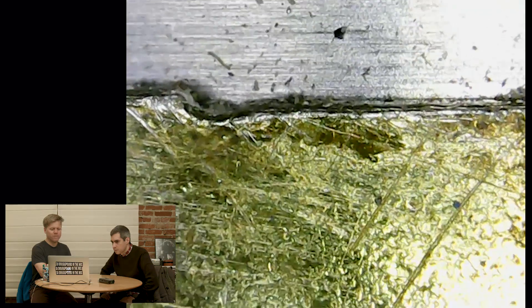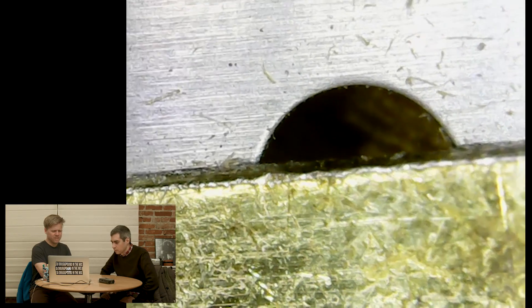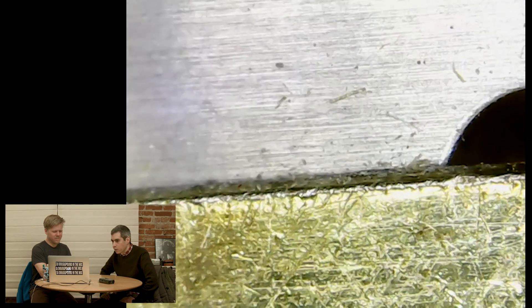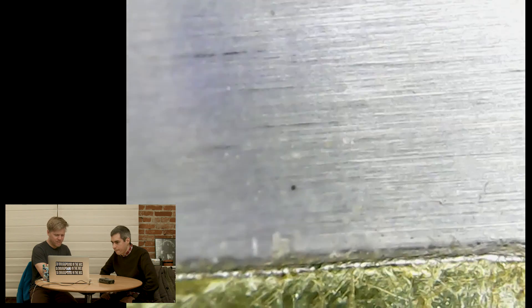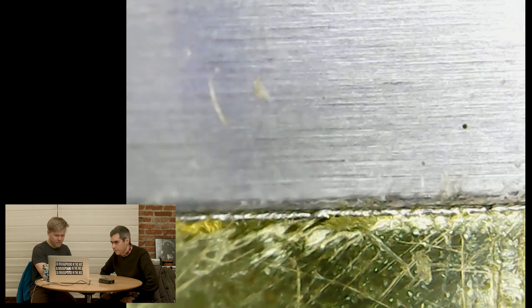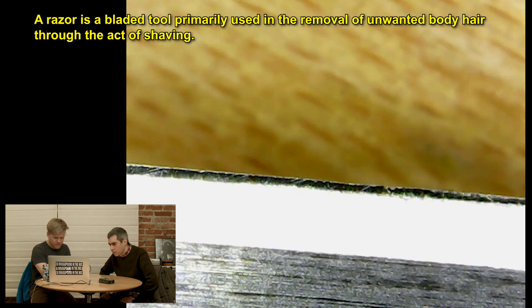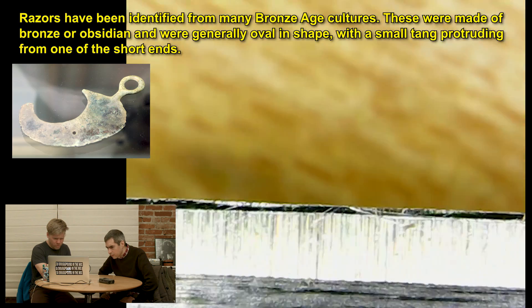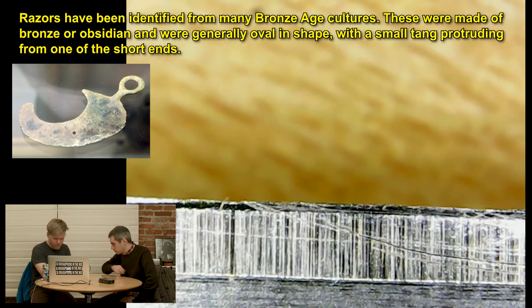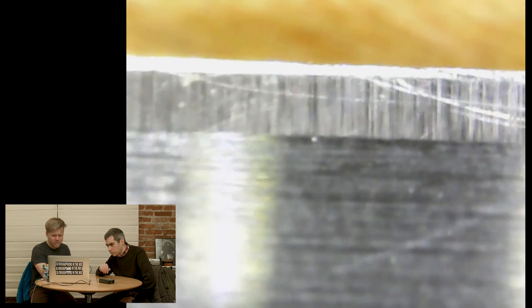Here's where the blade meets the thing that holds it. Isn't that crazy? That's just a razor blade. This is not the razor blade edge yet — this is where it kind of slips in. Here's the tip. This is the tip of a razor blade. Now that can cut you. It's kind of got two edges to it. They do a wide bevel, and then a super tight one at the tip.